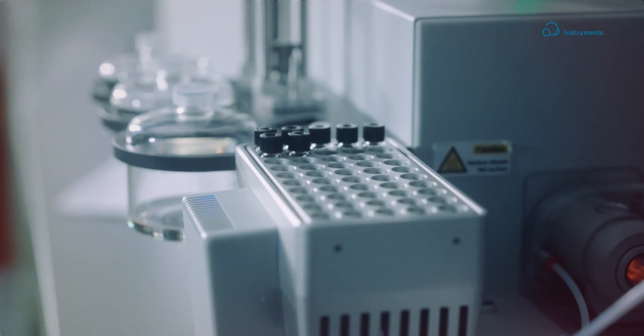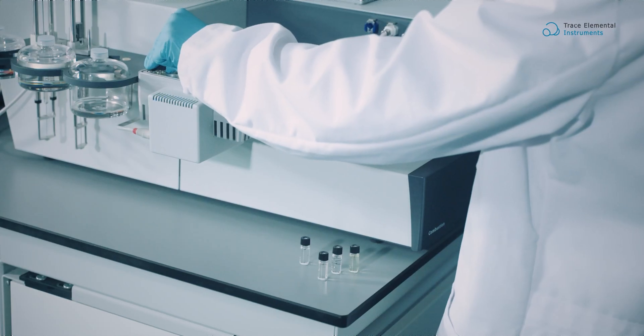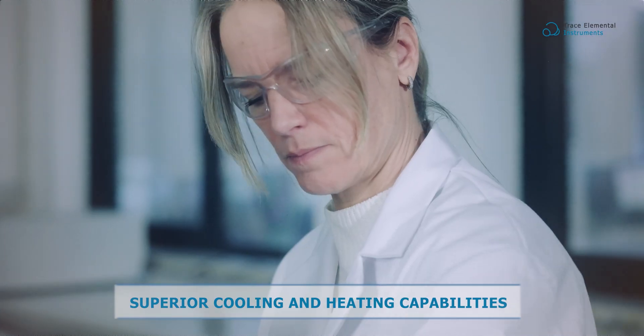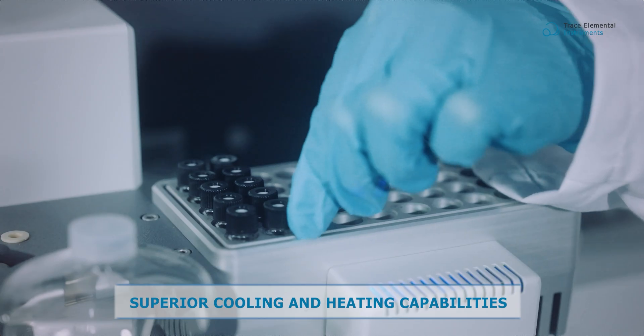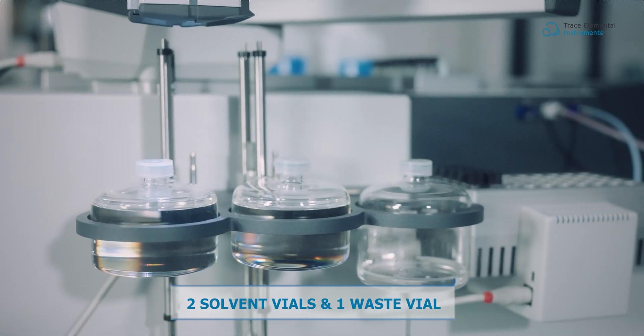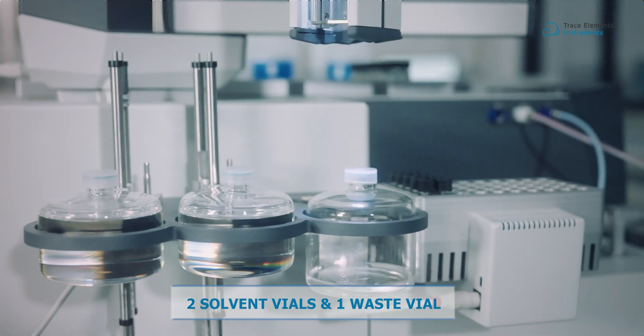Vectra provides high-performance conditioned trays with a capacity to accommodate 100 samples, ensuring efficient cooling and heating for optimal sample handling. Equipped with two large visible solvent vials and one spacious waste vial, carryover is eliminated.